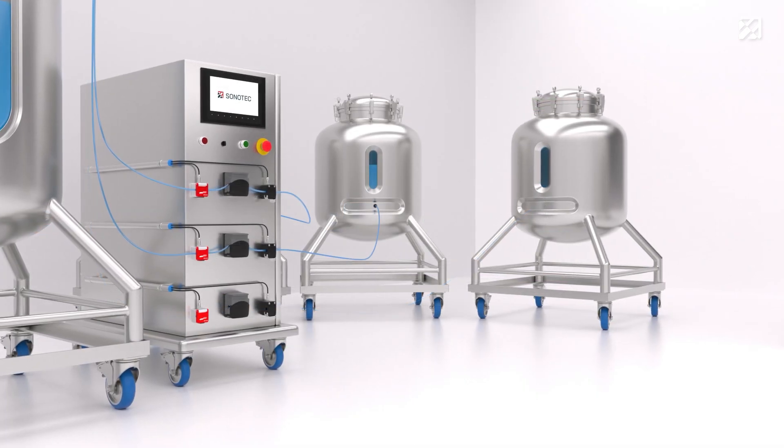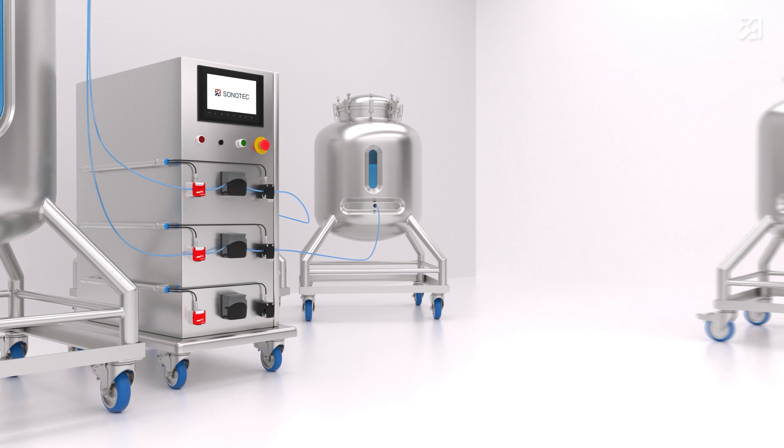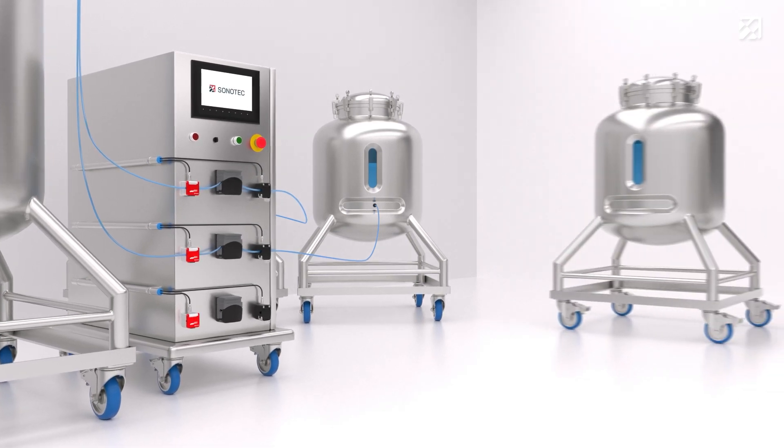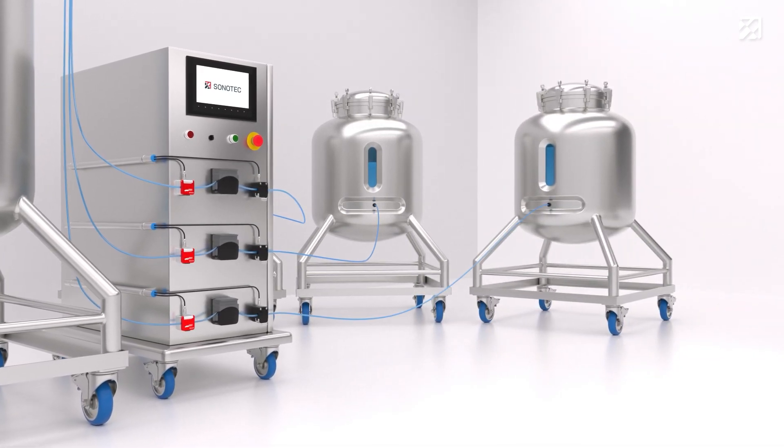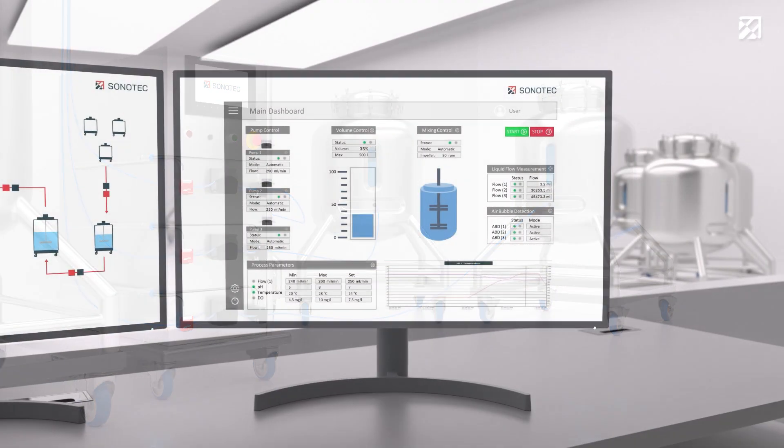As soon as a new media container is in place, the operator restarts the process. The flow meter starts counting the volume from the beginning.